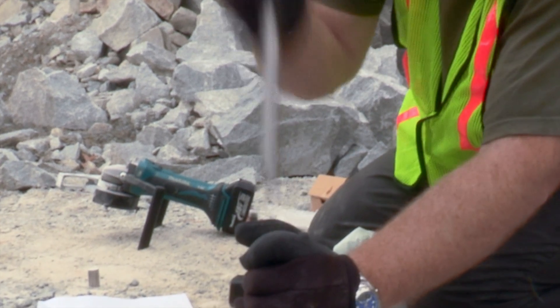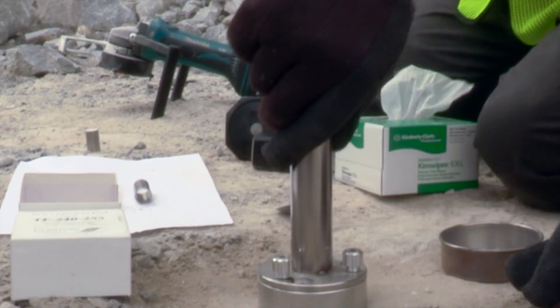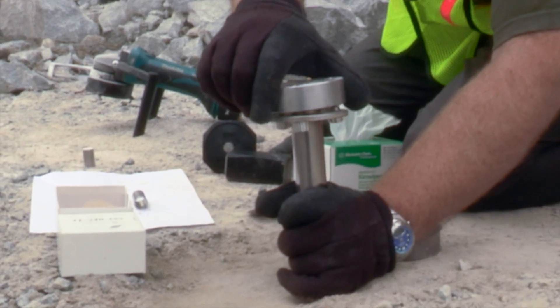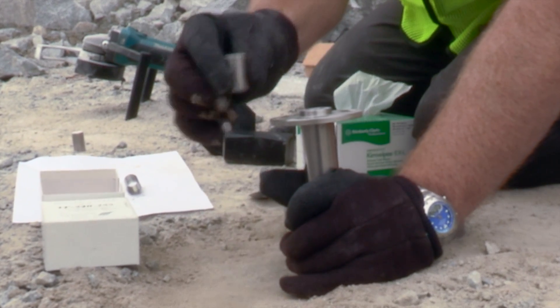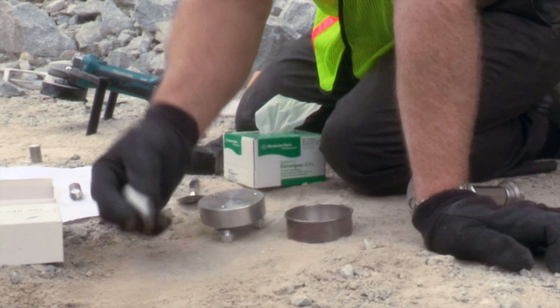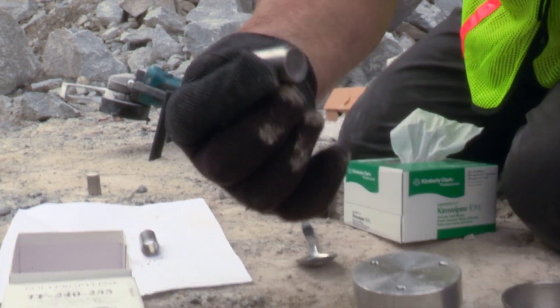Now you may remove the piston. Then loosen the screws to separate the base from the tube so you can remove the sample you just pelletized. Make sure you invert the press so you do not lose your pellet. The stainless steel pellet press must be at least half filled with material for proper analysis. If it is not half full, you must re-press another pellet.